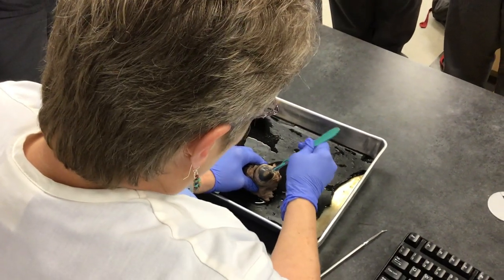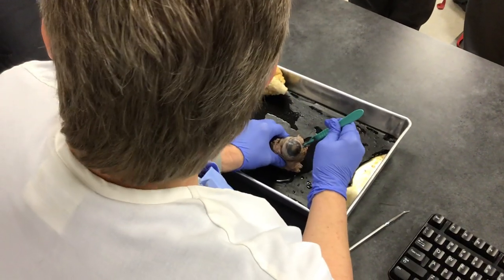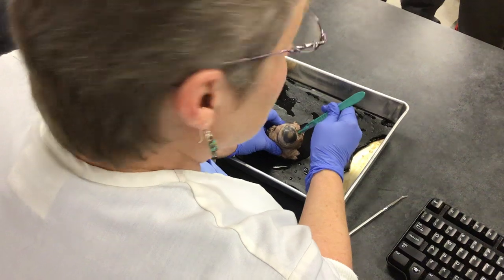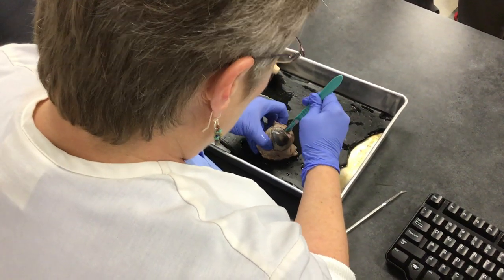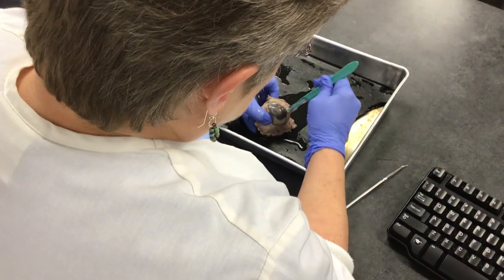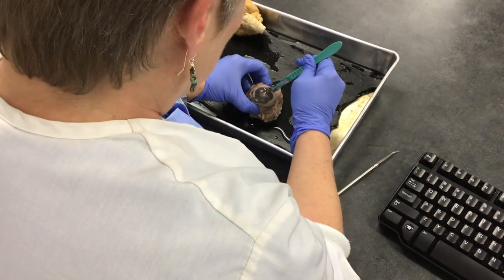Now I'm going to use my scalpel and go all the way around. But if you want, after you make the incision, you can use scissors and cut all the way around if you'd like. What is that part called again? The sclera.